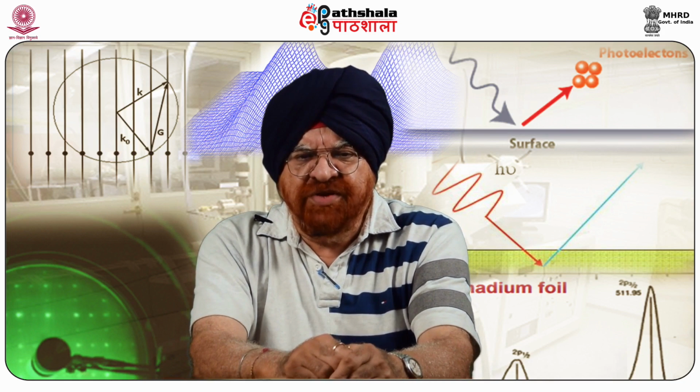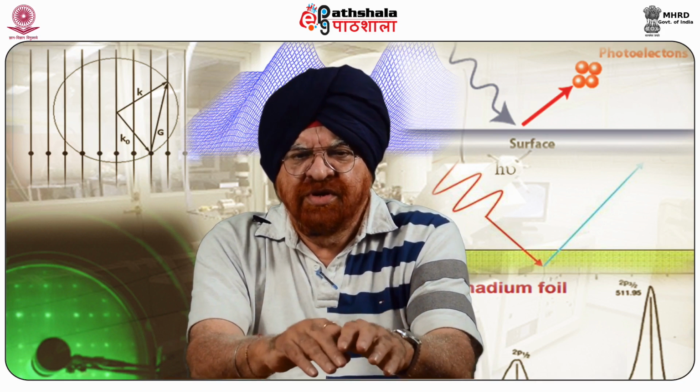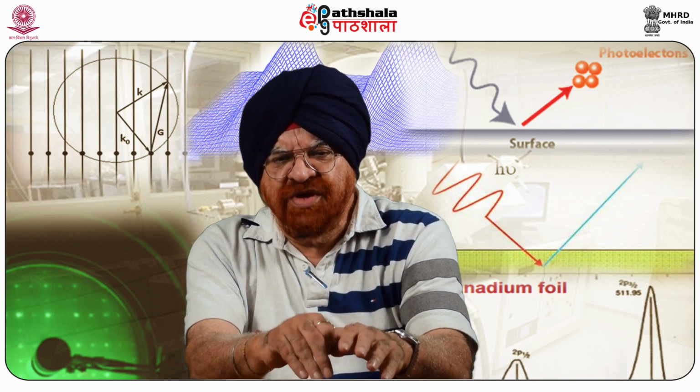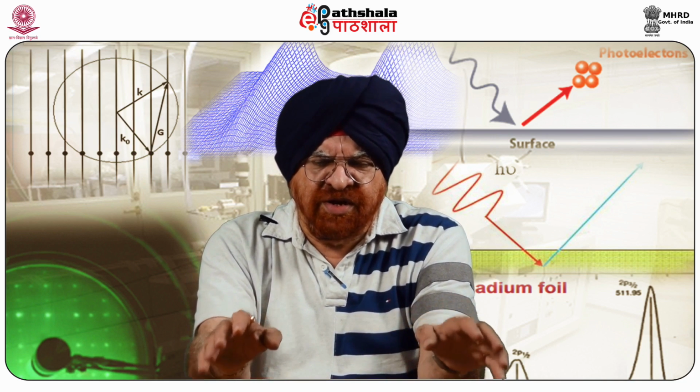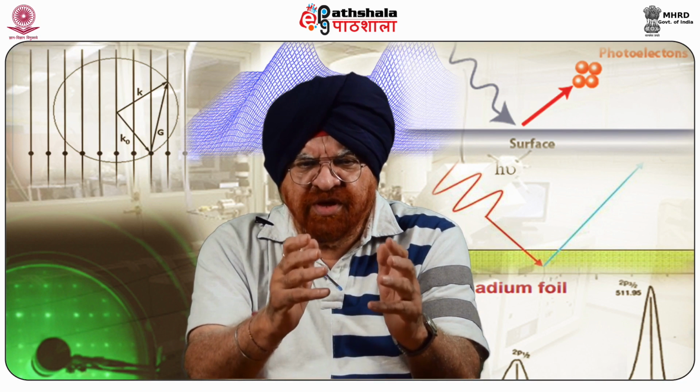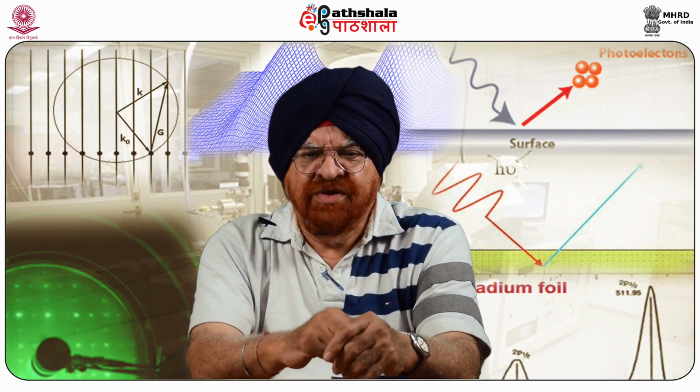This spectroscopy serves as the basis for determination of elemental composition, that is, the binding energy of each atom can be measured. As I said, this is a surface analytical technique. What is there at the surface can be verified and measured with the help of this technique.